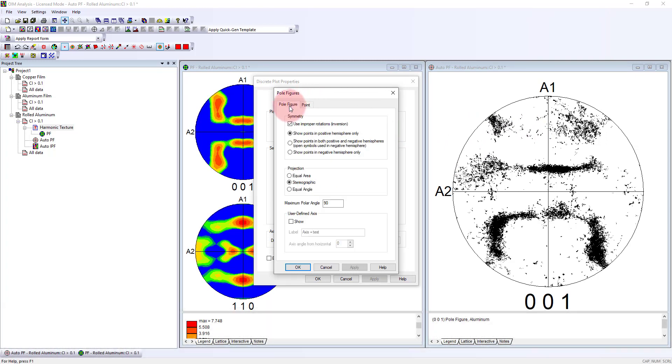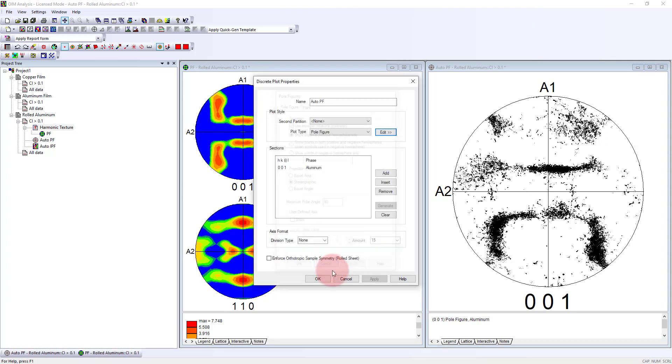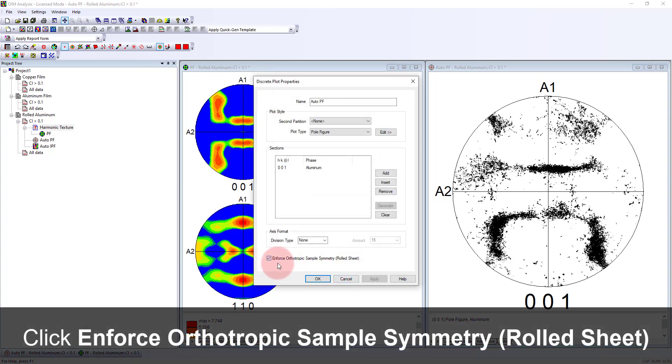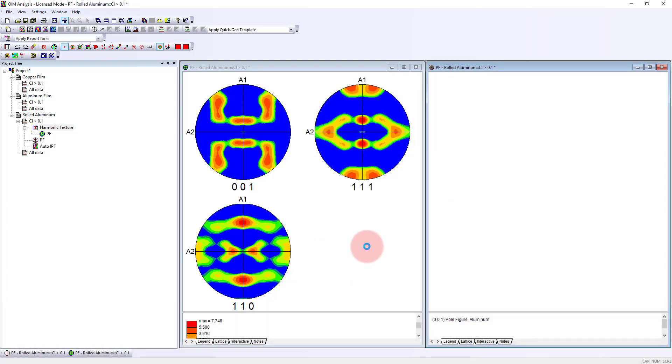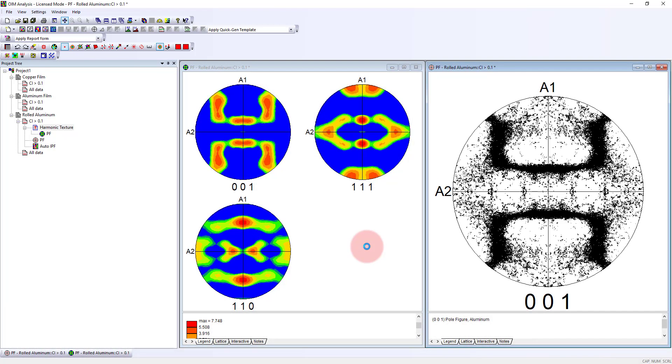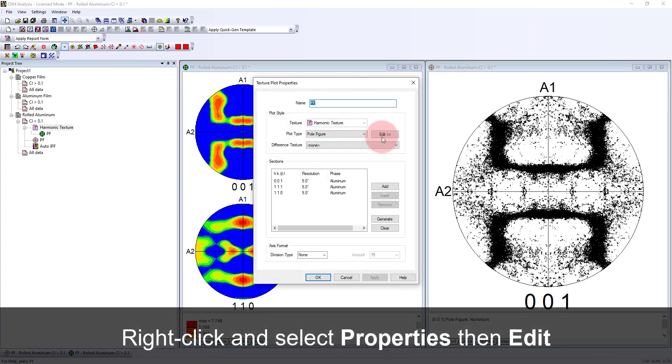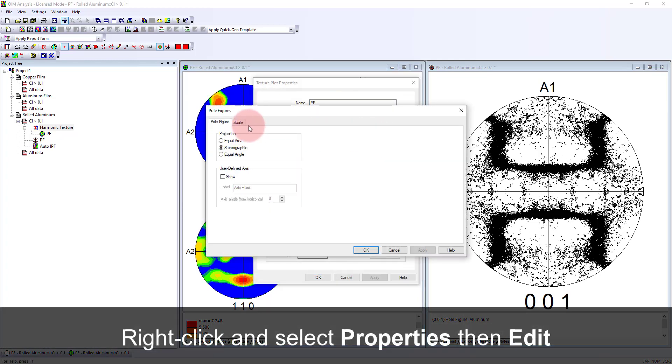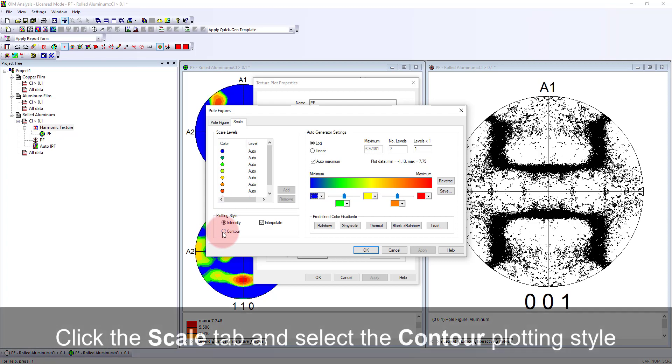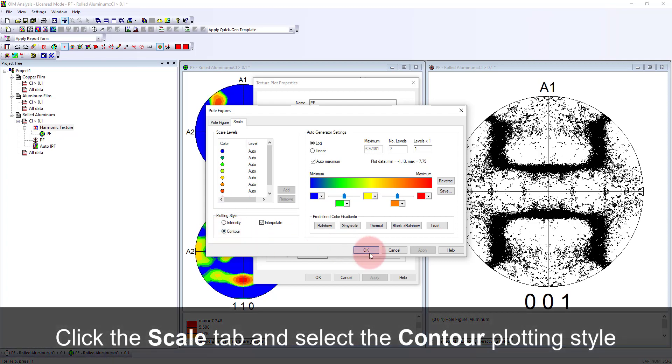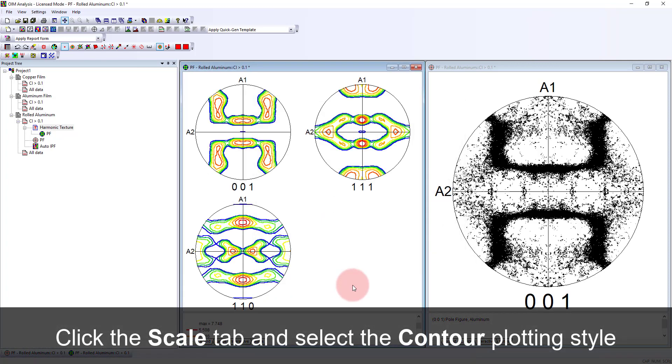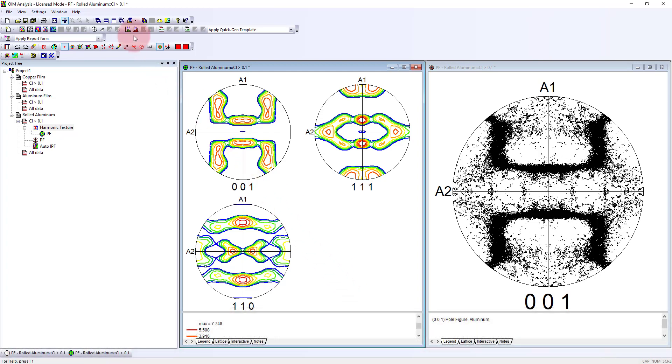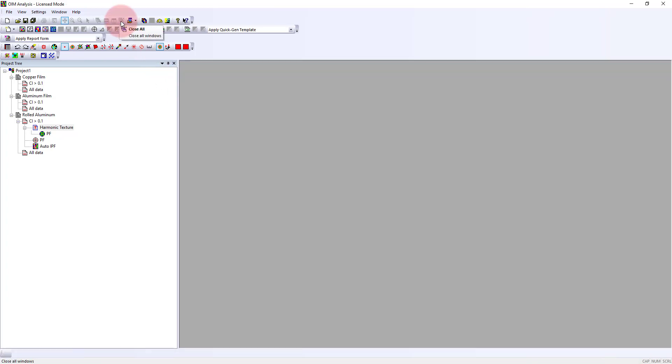We can do that for both the discrete and the density pole figures. Now we can see how those compare to one another. This shows both discrete and density pole figures. This can also be plotted as a contour plot, or we can use the full color density plot. Both of those are fine.